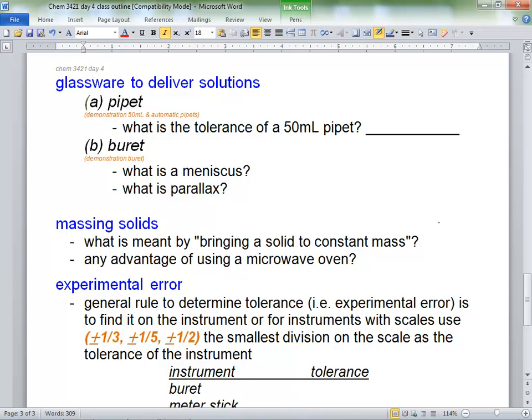But the only trick I have to doing this is I have my thumb right up here, because that's the trick that I have. I go way past the line, and then I pop it off with my thumb, and it's so much easier to control. Bring it up to your eye so you avoid the P word. What's the P word? Parallax. Now I'm ready to dispense. Right? Okay.